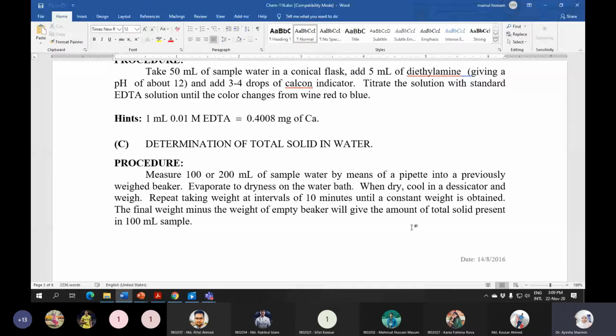Okay, so these silicas are there to absorb any leftover moisture present there. The moisture in the air, from water vapor, these silica gels can capture. So it makes a dry situation for the substance. So in a desiccator, we also create this kind of situation. We have a lot more silica gel in there, and so we place that dried beaker inside that, let it cool, and then you take the weight.